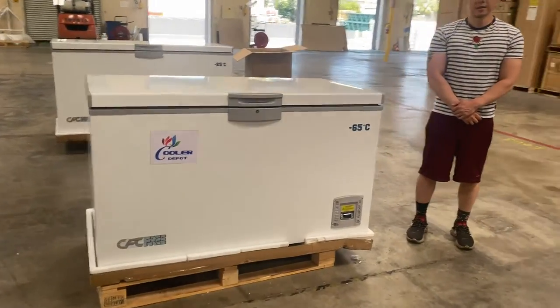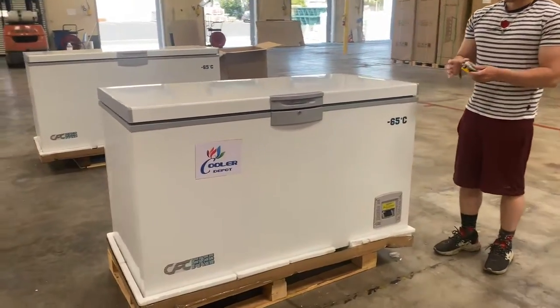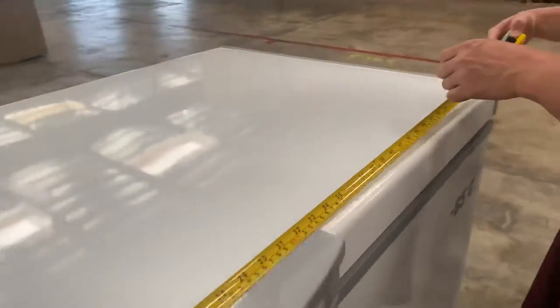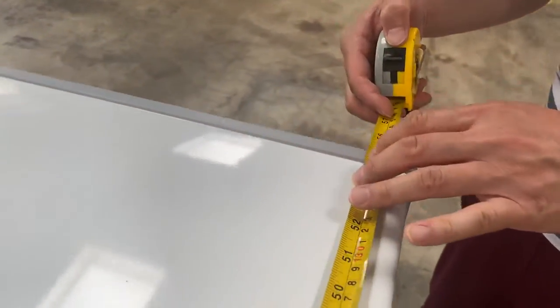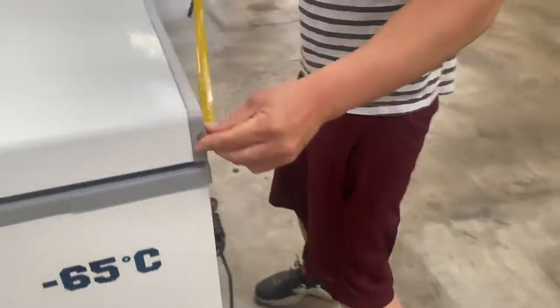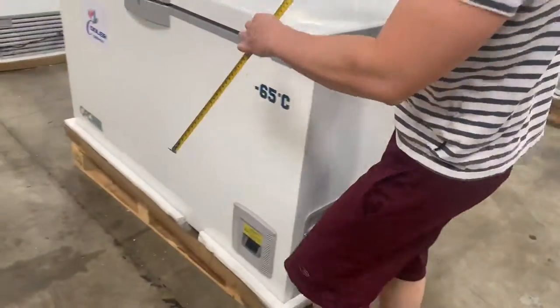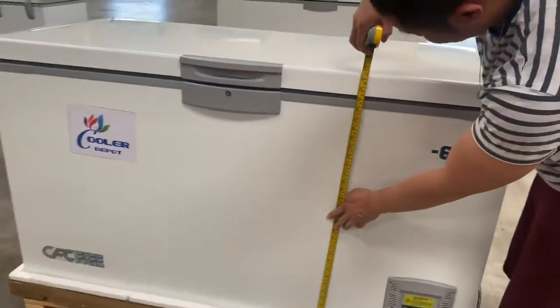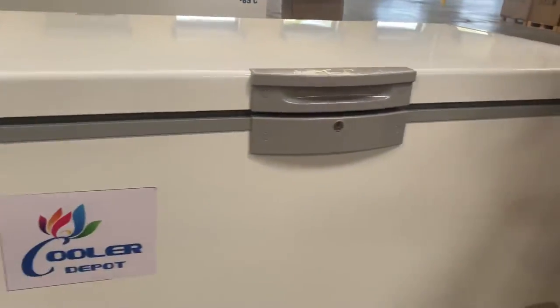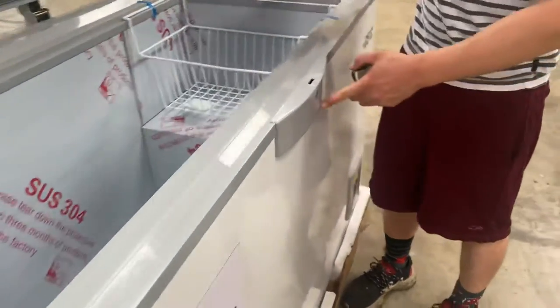This is our negative 65 degrees Celsius medicinal storage vaccine chest freezer. Let me show you the external dimensions. The length is 55 and a quarter inches, the depth is 26 and a half inches, and the height is 31 and a half inches tall. You will be provided with keys and a lock, so whenever it's not in use, you can lock it.